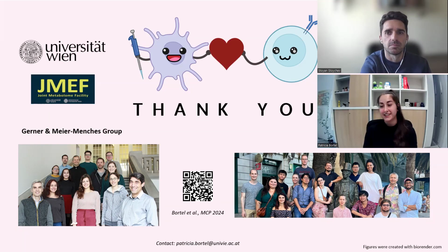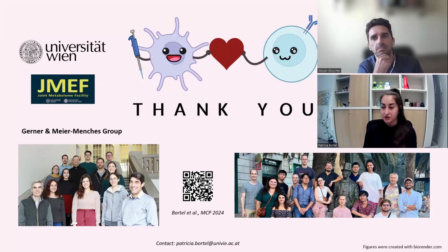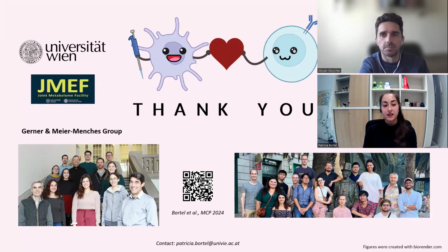Yeah, now I get the question. Thank you for clarifying. For the Astral here, we only tested the optimized workflow, the sequential with the increasing beads. I understand that it would make sense to also test the standard workflow, but we got the sequential enrichment to work so efficiently and so well that for this project, we didn't see why we should go back to the standard.